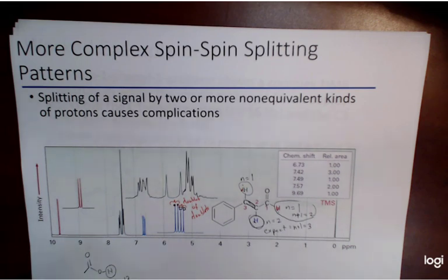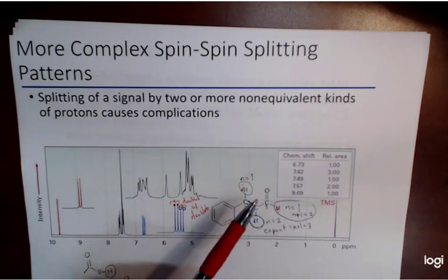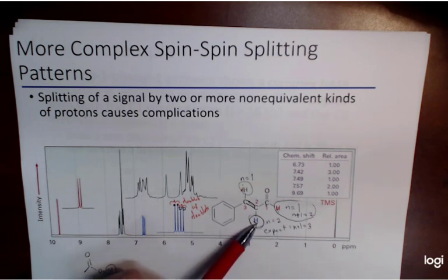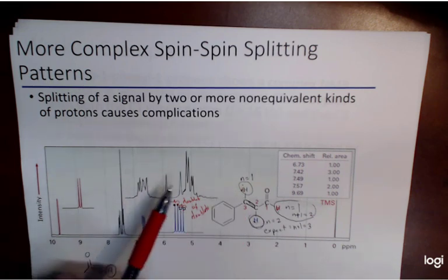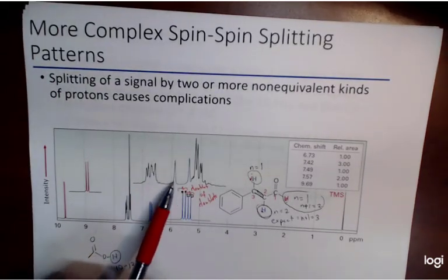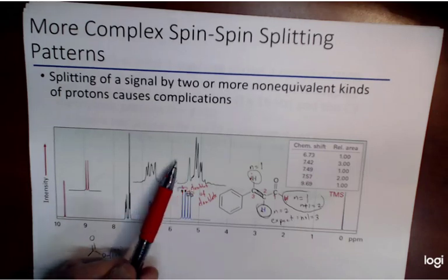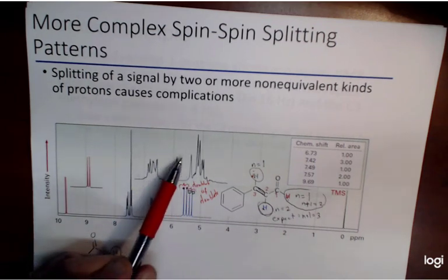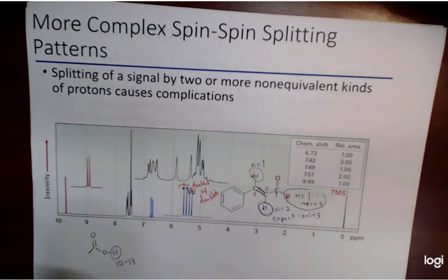All right. And the other thing I kind of want to point out here is, since this hydrogen only has 1 neighbor with hydrogens, you do just see a doublet, right? So the green, so here it's elaborated. I know it looks like they're very far apart, but this is a doublet, okay? That green peak right there, which is so smushed together, this is a doublet, all right? It's not a doublet of singlets, it's a doublet.